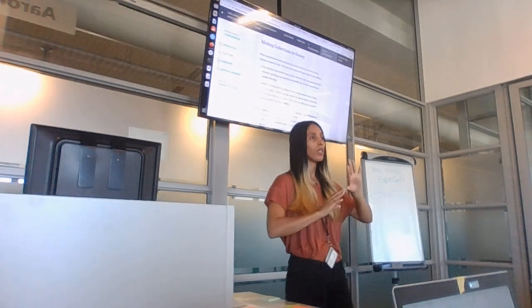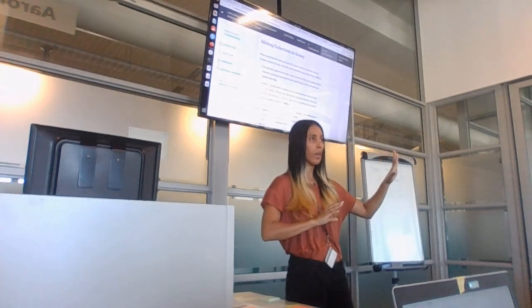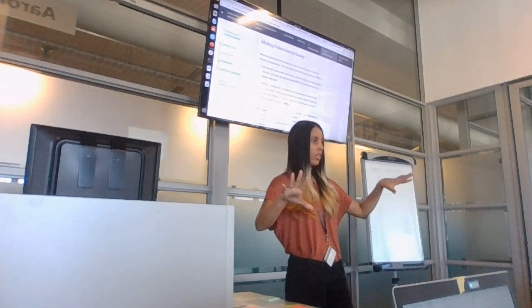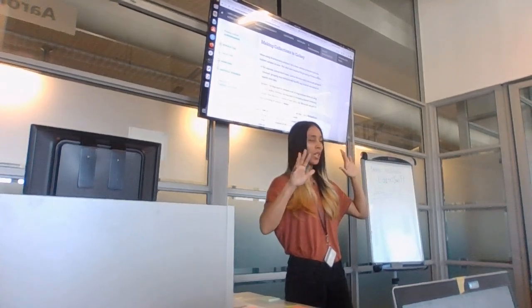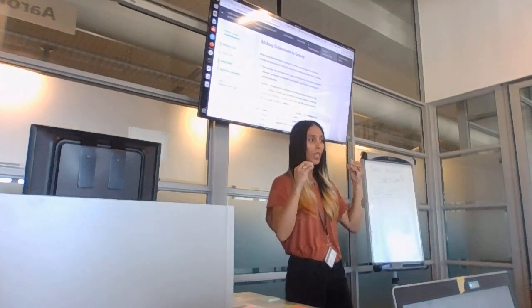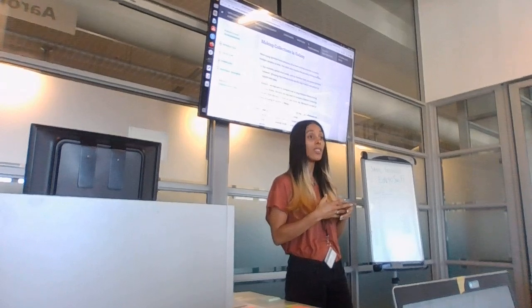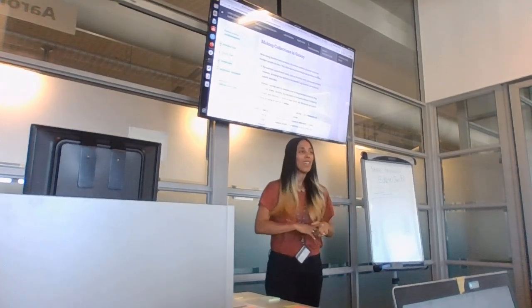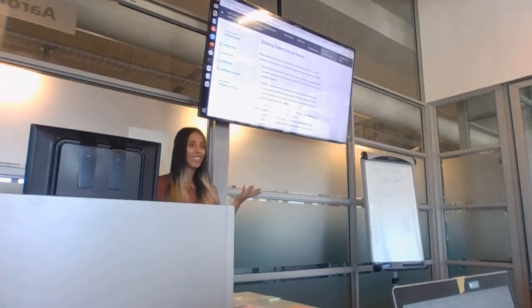And maybe I've got a SARS-CoV sample from the Gambia that I want to compare to Tunisia. What is another name that you hear often for collection? It starts with a D. Database. The first part, data set, right?